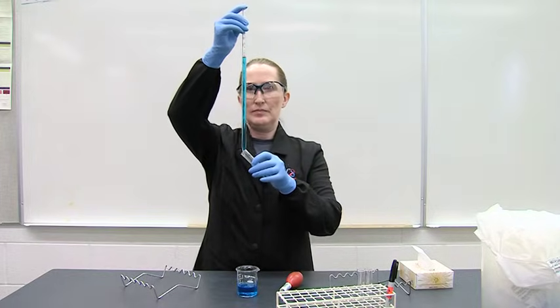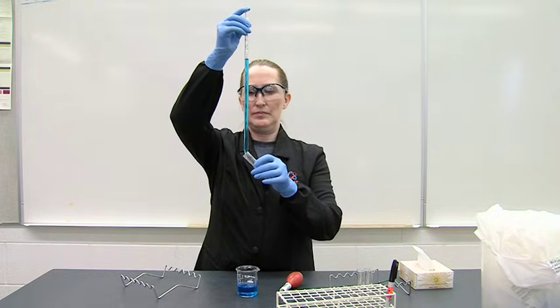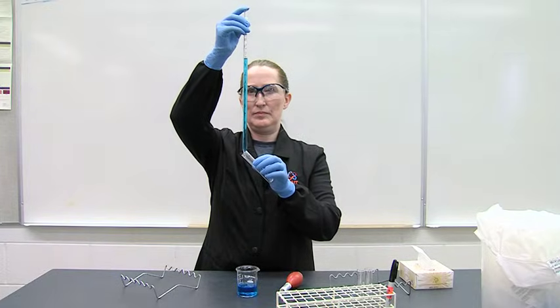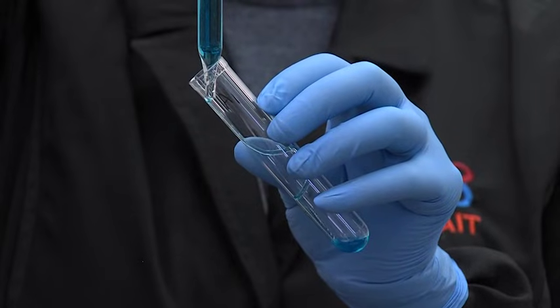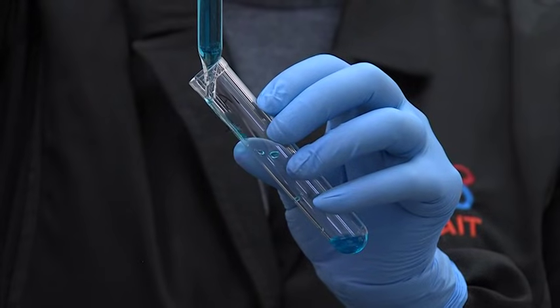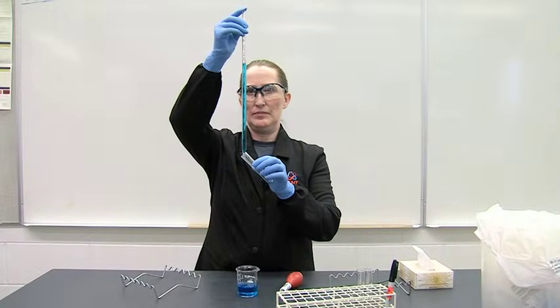Raise the graduation line of the volume to be delivered to eye level. Release some pressure from the index finger to allow the liquid to flow at a slow and steady rate. Press down firmly with the index finger when the meniscus has reached the desired graduation.